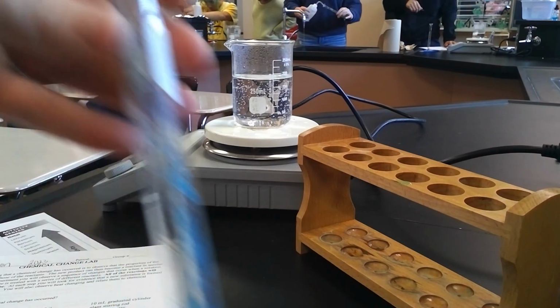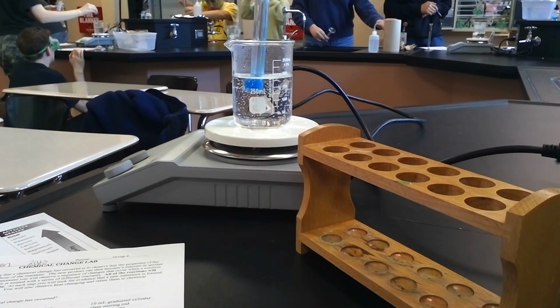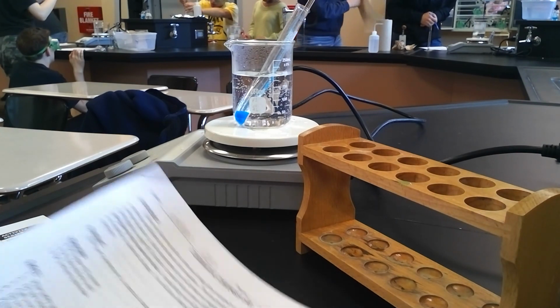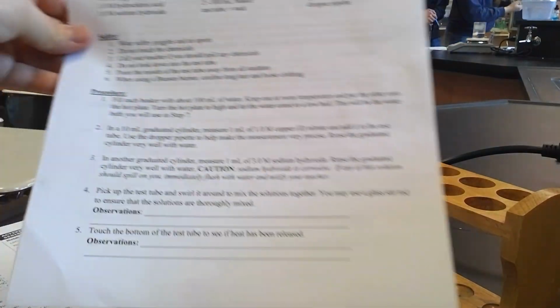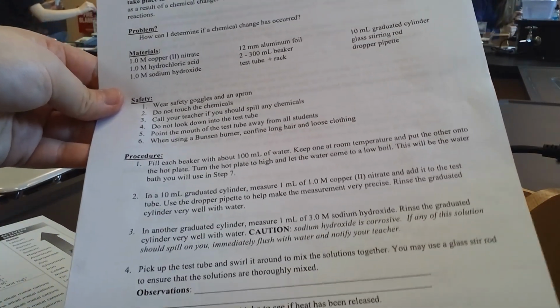And I'm going to take this whole thing and place it into the hot water bath. So you can see some steam already starting to form there. This is going into the hot water bath. So as far as our observations, while this is in the hot water bath, I'll go back and fill in. So pick up the test tube and swirl it around to mix the solutions together. You may use glass stir rod to ensure the solutions are thoroughly mixed.